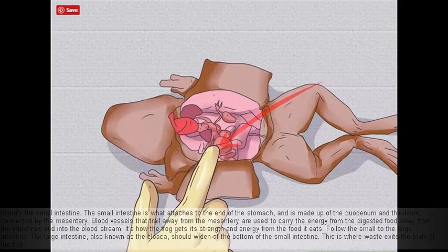Follow the small to the large intestine. The large intestine, also known as the cloaca, should widen at the bottom of the small intestine. This is where waste exits the body of the frog.